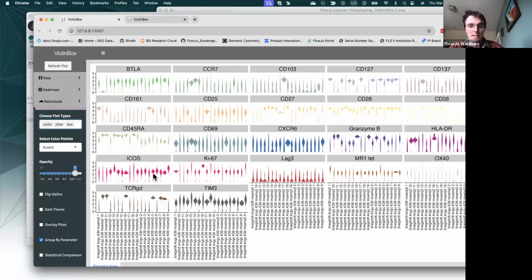There's a lot of background, and these are still some middle expression, but it gives us an idea of what these different clusters are. We can see that gamma delta T cells, again, are really standing out. These 6 are definitely my gamma delta T cells. The rest are not.